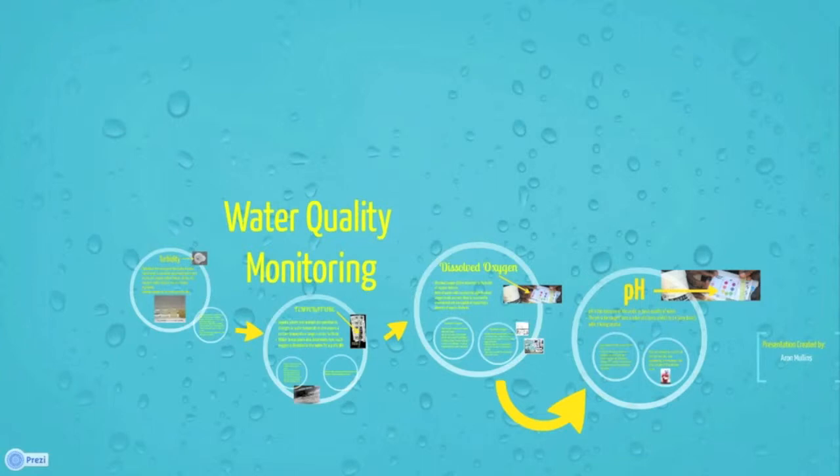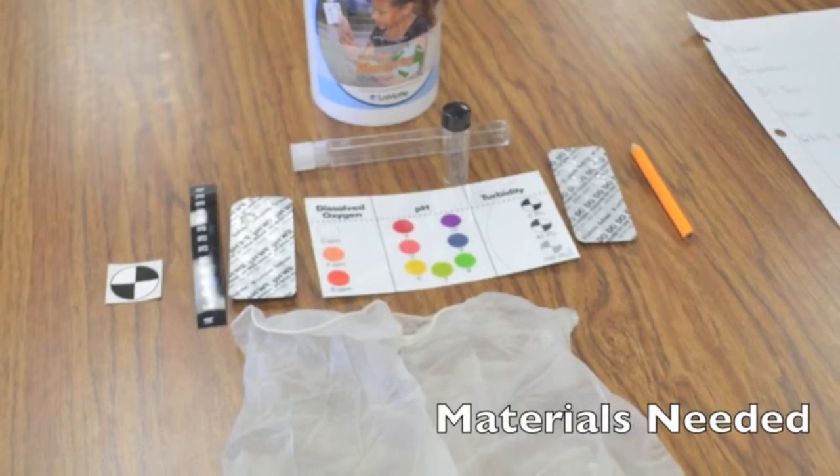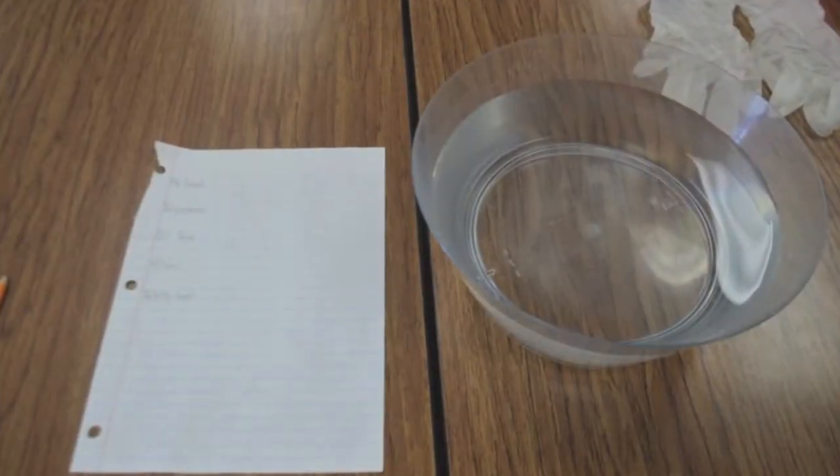This is the AquaAct instructional video. We made this video to show you how to water test. This is our logo that we made to represent our project and what it means. Here are the materials that you will need for testing.